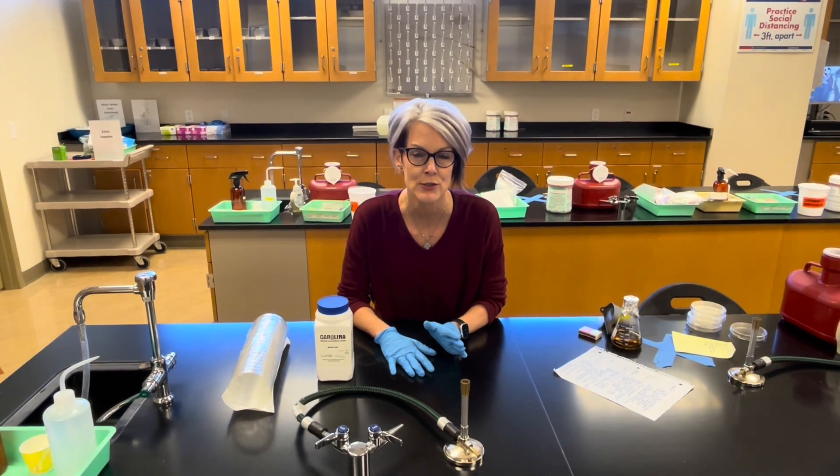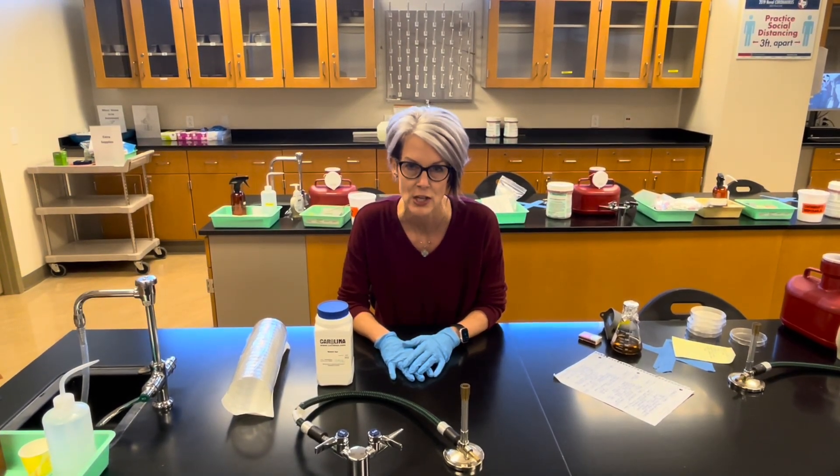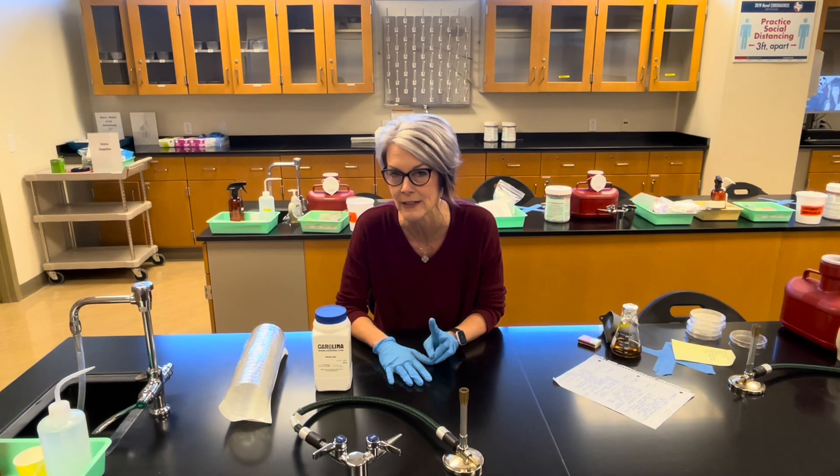Today is all about microbiological media. You are going to be pouring four nutrient agar plates. Nutrient agar is a complex, general-purpose media — most organisms grow on it. There are two ways you can make it.